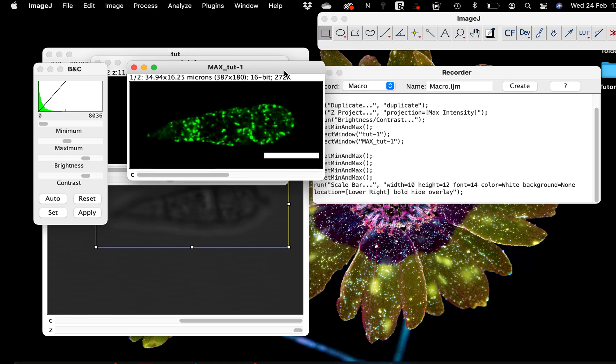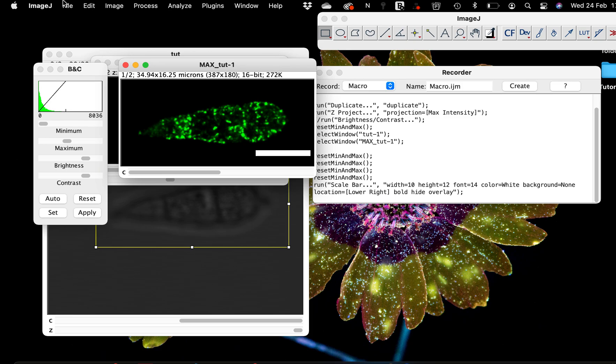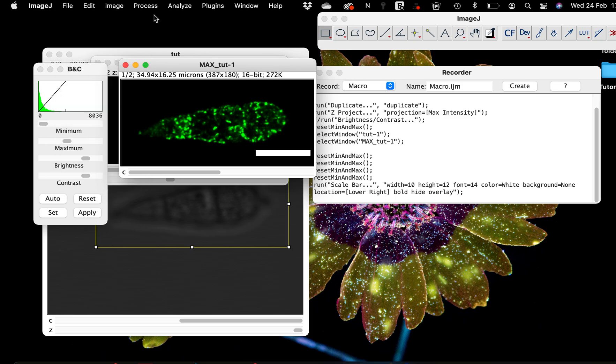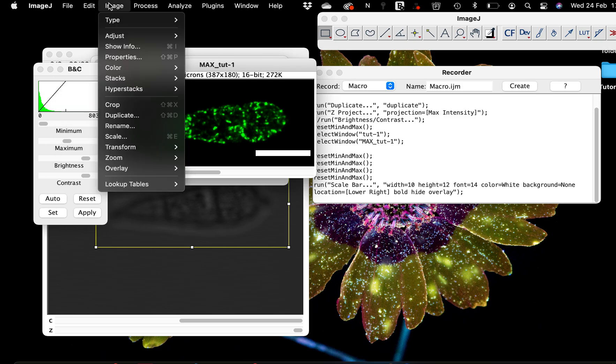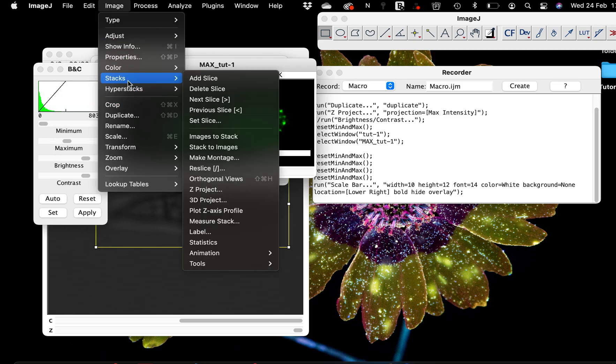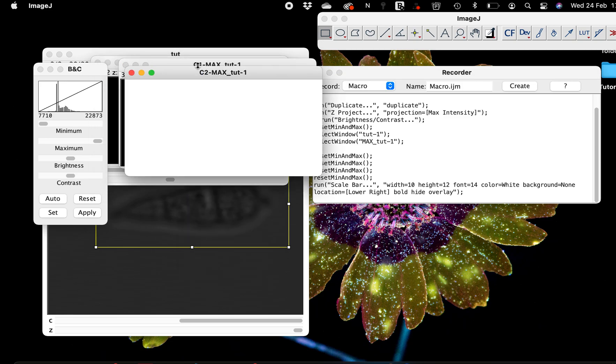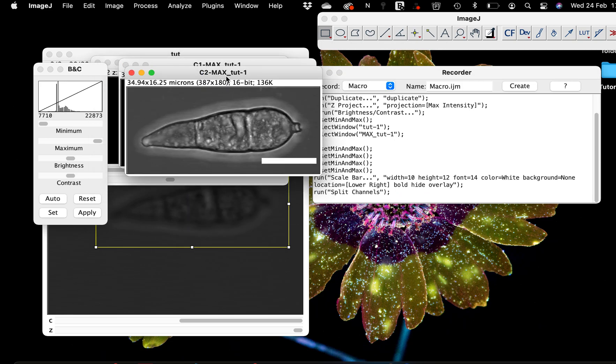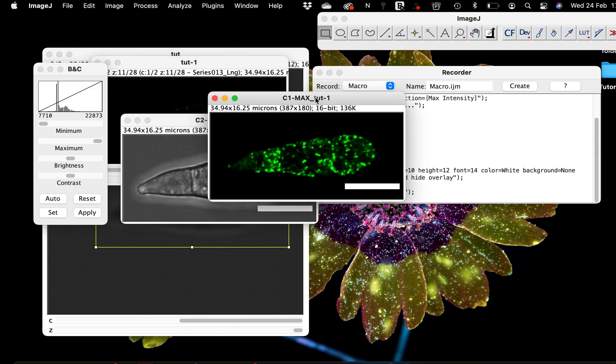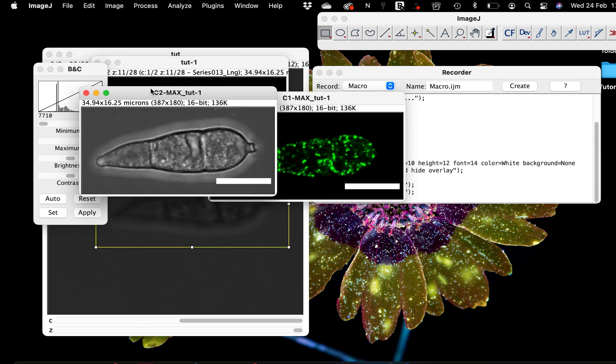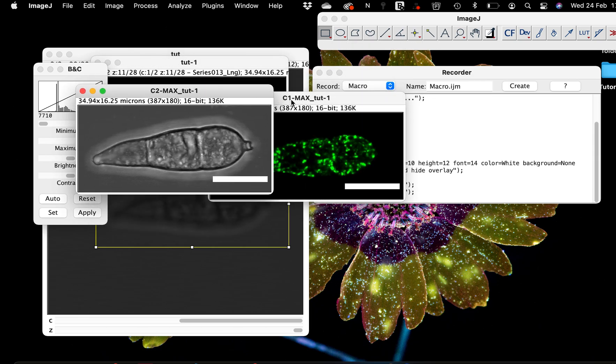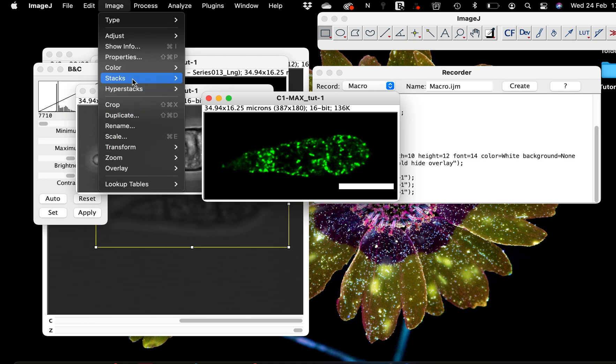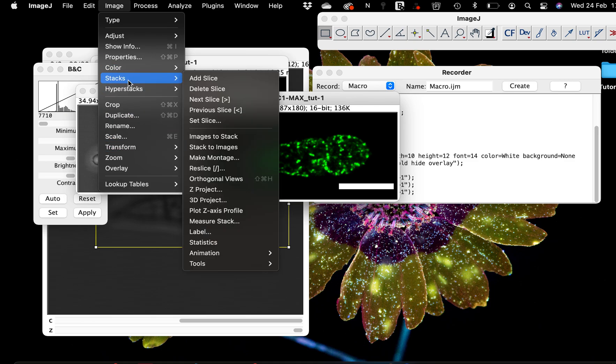And the next thing is for me to save this image. Now to duplicate the Z-stack, the maximum projection, so we split the channel. When we do that we have these two images apart and I'm going to save them individually.